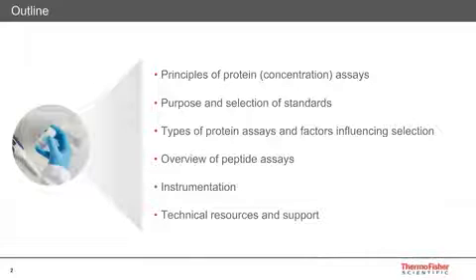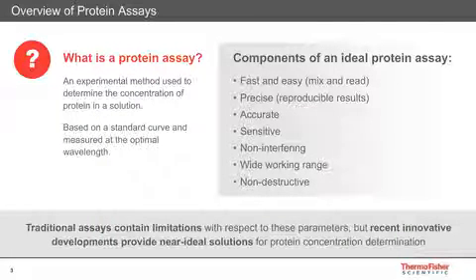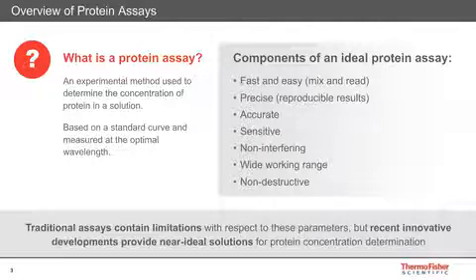Hello, thank you for that introduction. I'm going to be talking about protein concentration assays, novel, simplified, and rapid techniques for quantifying proteins in solution. So this is going to be the outline of my talk. It's going to be principles of protein concentration assays, the purpose and selection of standards, types of protein assays, and factors influencing the selection, an overview of peptide assays, instrumentation, and technical resources and support.